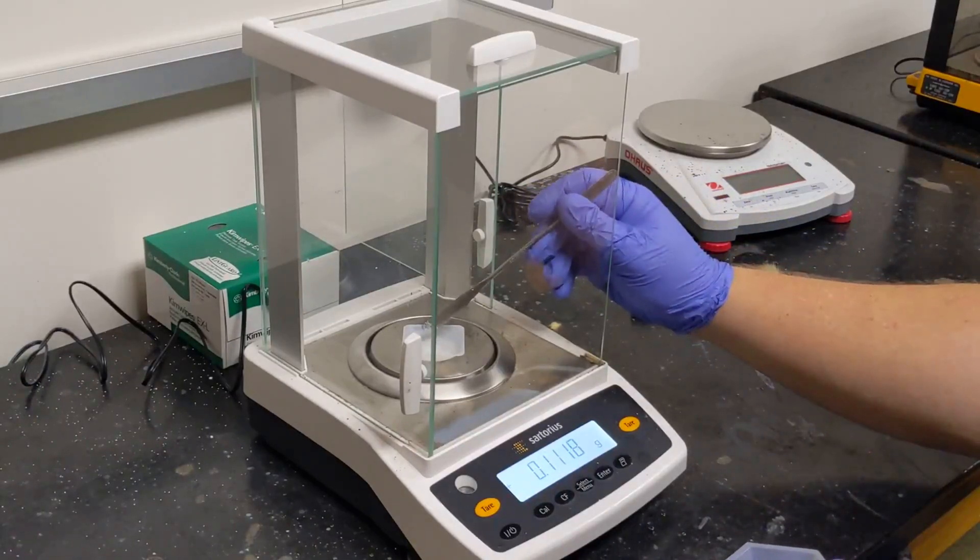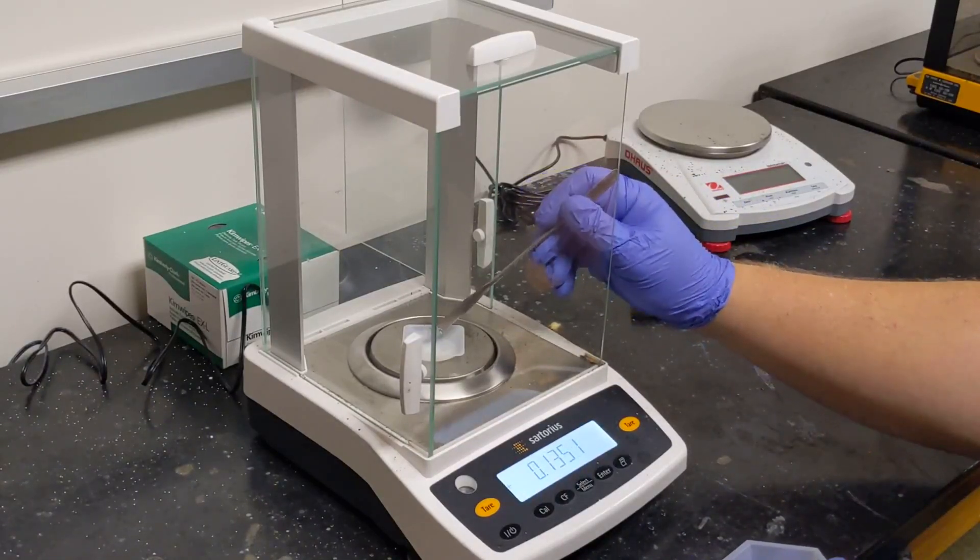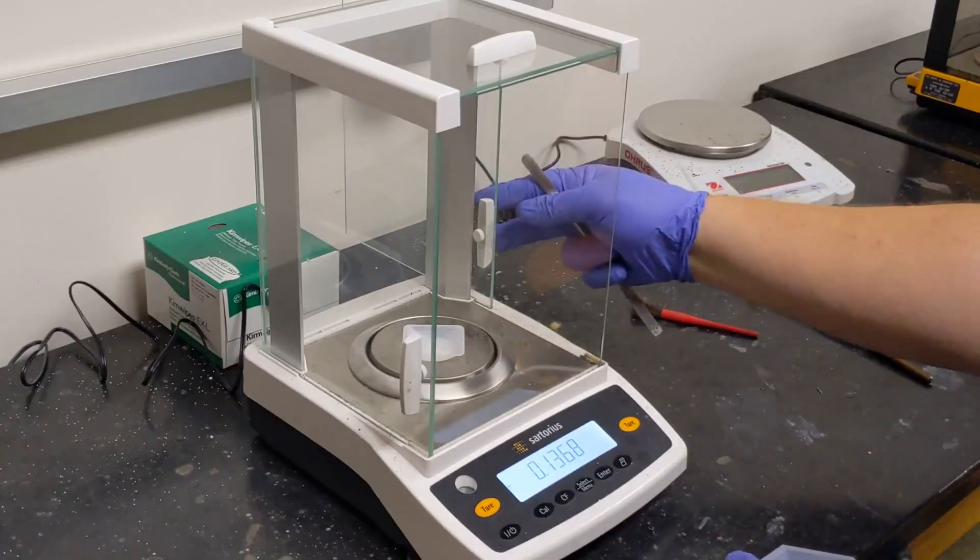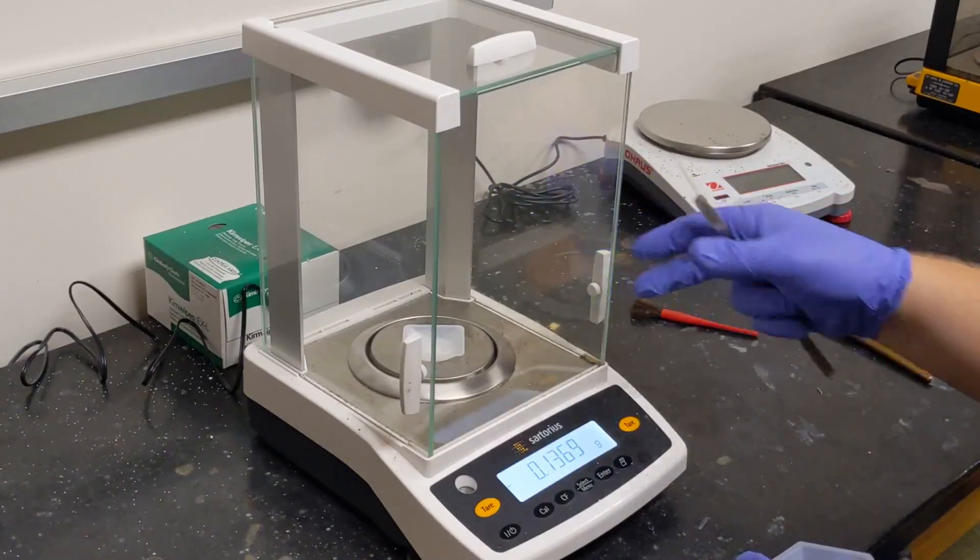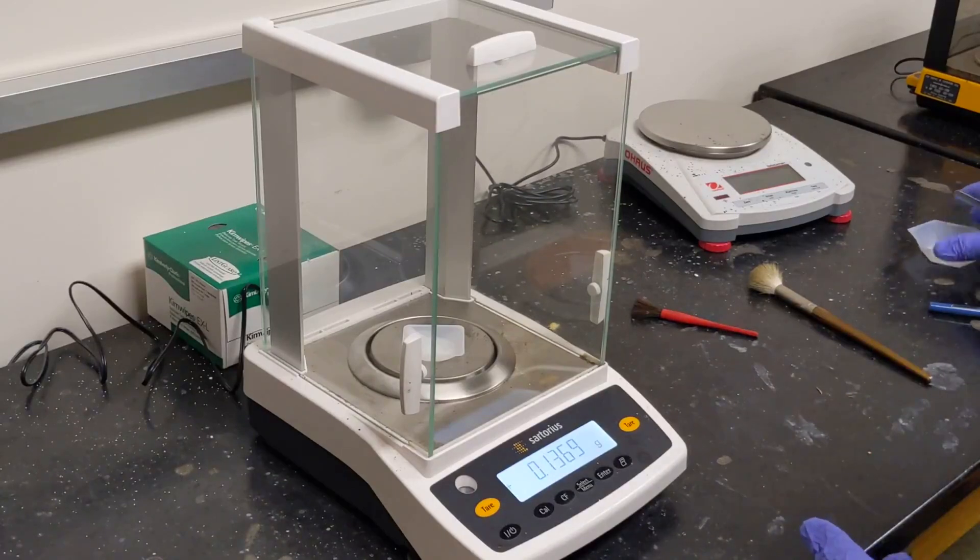You'll see the mass displayed on the screen of the balance. Once we have our desired amount, we're going to slide the door closed, give it a second for the mass to settle, and then record this mass in our laboratory notebook.